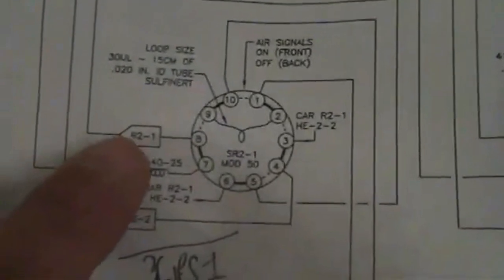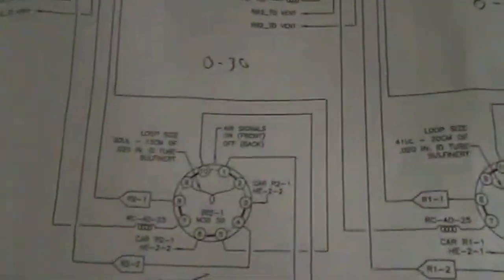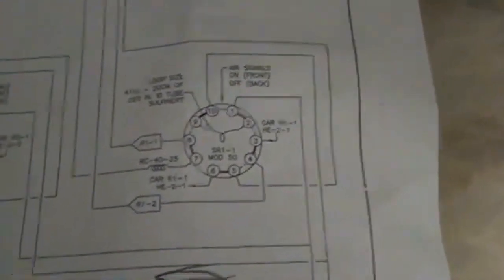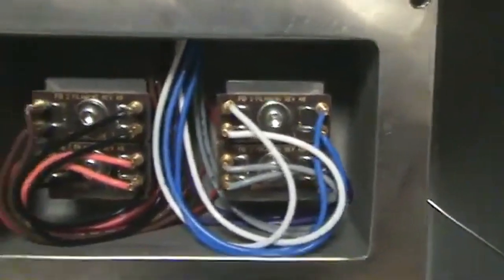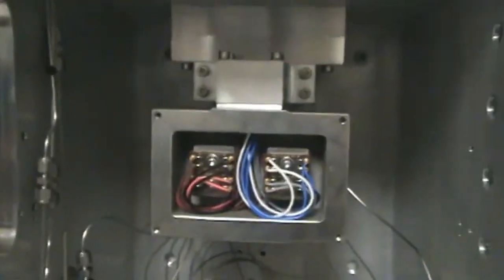So you're going to backflush out of column number 1. On one case, we only want the lights coming through, and then we're going to backflush the heavies. The other one, we're going to let the lights fly through, and then we're going to backflush, I guess, C6. There's our little detectors, our beads, on the other side of those goes 30K. 30,000 ohms.